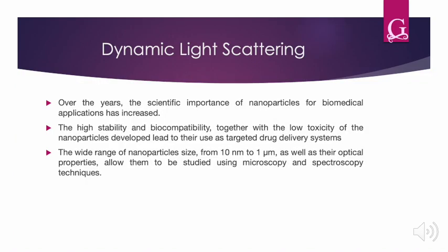Over the years, the scientific importance of nanoparticles for biomedical application has increased. طبعا زيادة استخدامهم in biomedical application due to different reasons. أول إشي very high stability and biocompatibility. بالإضافة للlow toxicity، هذا خلى النانو بارتيكلز تكون as a target drug delivery system.